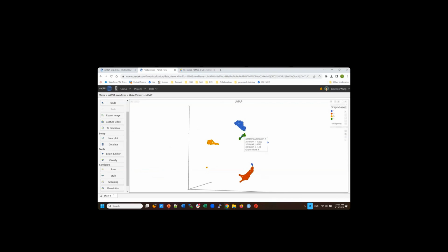And this dot is similar not to this green, but to here. And then the yellow is, I got 2 clusters here, right? Because with UMAP you only see one perspective of your data, and a graph-based view is also limited; a human cannot see the full picture of your data. That's why we have to use different perspectives and try to piece all the puzzles together, right?